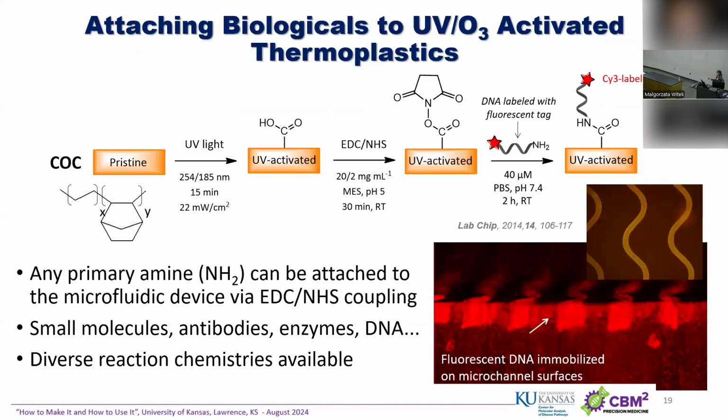So what can you do with this? Well, you can attach oligonucleotides using this EDC NHS chemistry, what we call it. Basically it uses those carboxy functionalities, creates an ester, succinimidyl NHS ester, a hydroxysuccinimidyl ester.